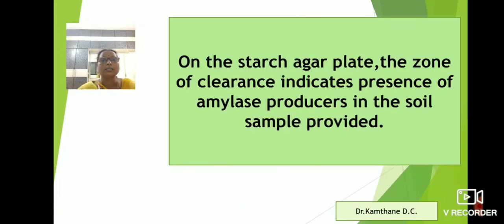This is the zone of clearance around the colony which is present on the starch agar plate. This indicates that the colony is able to produce the amylase enzyme and cause the hydrolysis of the starch. These are the microorganisms which are isolated from the soil sample.